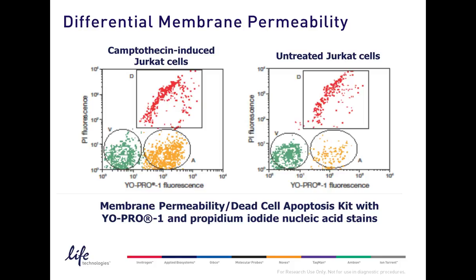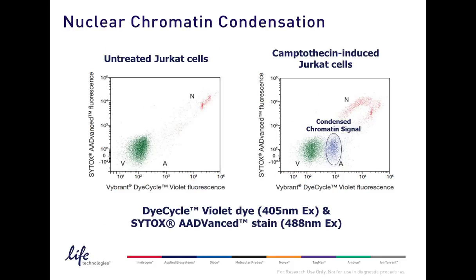As I say, the mechanism is not well understood, but it's fairly well used in the literature as a way of teasing out that subtle change in membrane permeability.